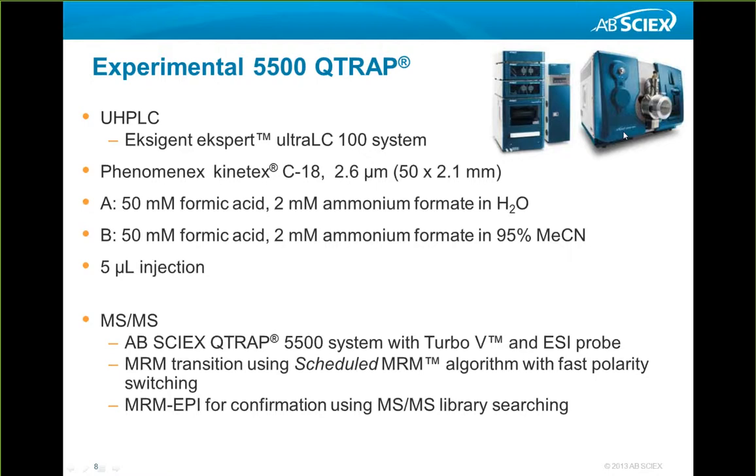The instrument that we are having on the mass spec side in this application can be, for example, the SCIEX QTRAP 4500, 5500 system, but we have also utilized, for example, the 3200 QTRAP version. We always have to focus a little bit on the guideline values, so sensitivity is a critical point and should always be evaluated when selecting the system.